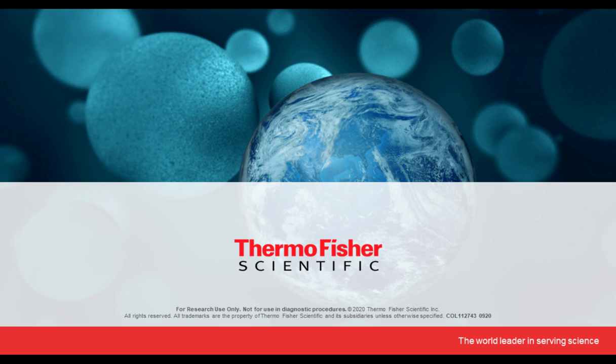You might be able to see some difference for some target proteins. But again, for most target proteins, it's not going to be an issue, and it would really not matter in terms of the results that you're getting, because it would uniformly affect the membrane. It's not really specific for any single protein.